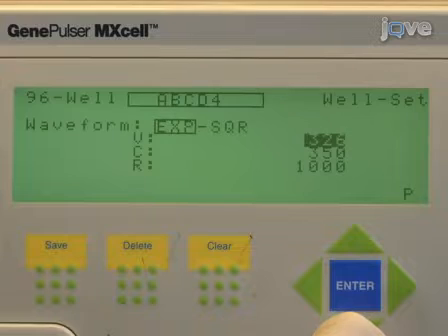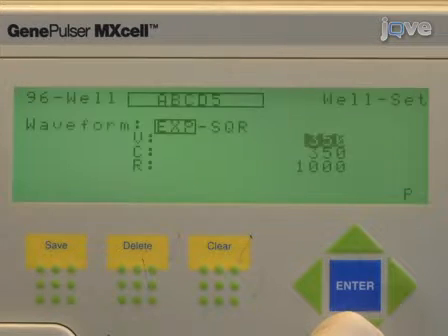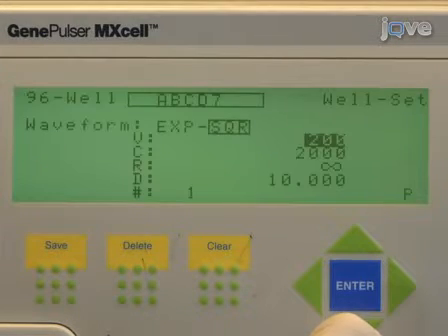Your experiment probably won't involve different ages of cells, but you can follow the same procedure with your own experimental design. If you want to compare gene expression in control and treated cells, you can first find the best conditions, and then do your experiment using the conditions you've identified. Or, you can do your optimization and experiment together, like I will demonstrate today. I'll be using a GFP encoding plasmid to look at transfection efficiency by flow cytometry, but the electroporation procedure would be the same even if you're doing something different, like introducing siRNA and looking at gene expression by real-time PCR.